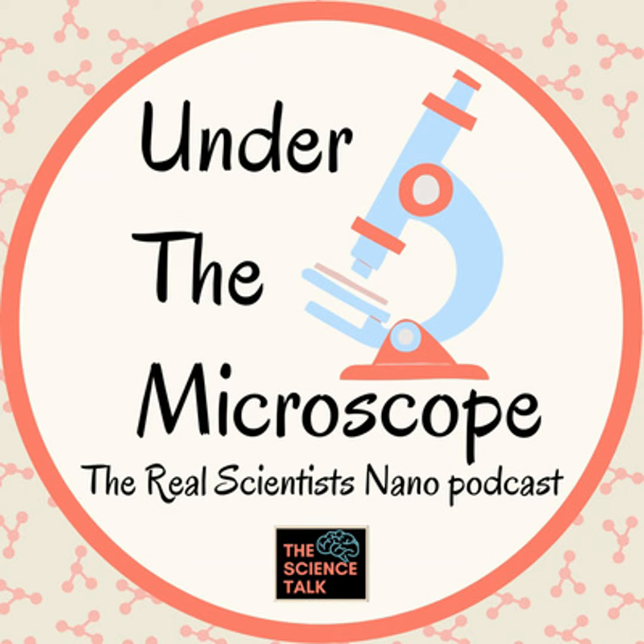And so the current job is building and managing microscopes at the European Bioinformatics Institute, which is a genetics lab. In my lab, the thing that they're most interested in is being able to look inside of cells that are inside of thin tissue sections, to see what genes are active in each cell.